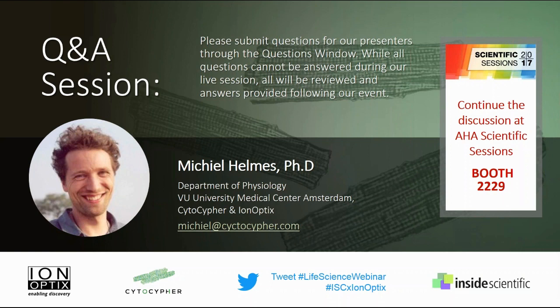Having said that, it is entirely possible to measure a well, incubate with a drug, and in the meanwhile measure the next well, and when you've measured the next well, you can return to the first well and measure the effect of the compound. Just to piggyback on that, Michael, one of the things that we're working on now is to introduce CO2 so that we could move away from HEPES and use bicarbonate buffered systems. The cells seem to do much better in bicarbonate buffered systems as well.